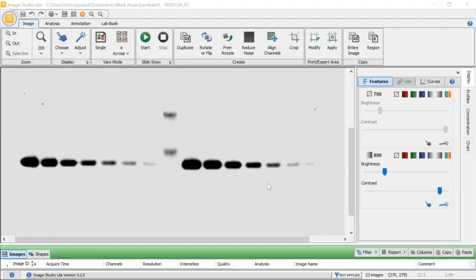If you're using another software platform to quantify your bands, some of these concepts will be applicable, but some may not. It's best to check with the software manufacturer on their own specific guidelines and tips for accurate, precise Western blotting analysis. So let's get started.